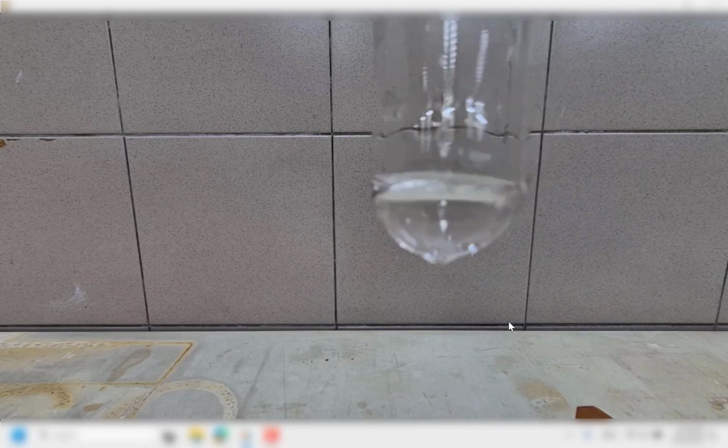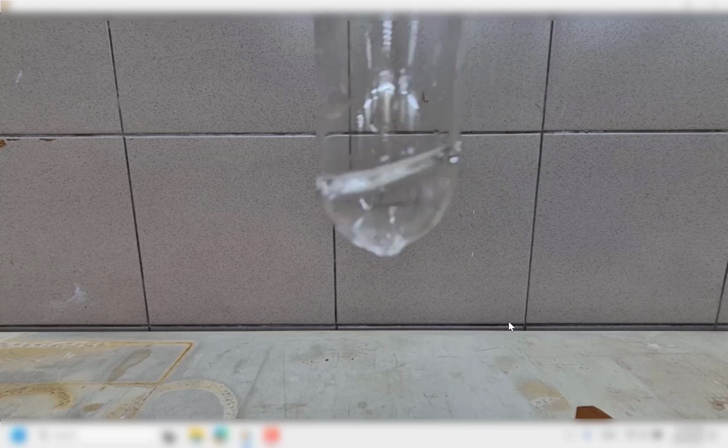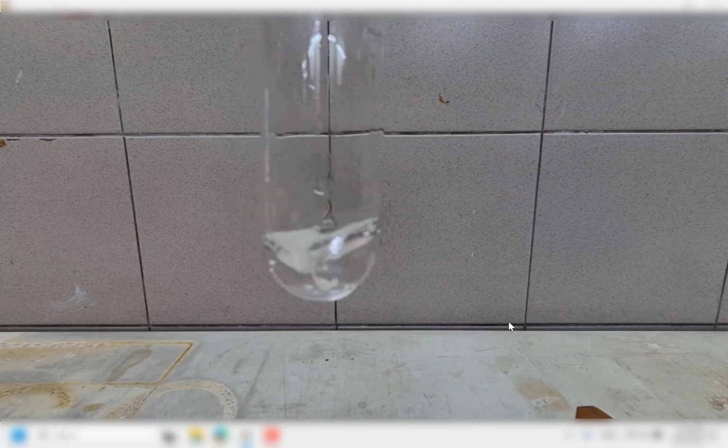Right now, let me play the video. The video has no sound, so I'll be the one voicing over. This is a washed boiling tube. You have FA1 here, and you notice that FA1 is colorless. You're supposed to add in 1 cm depth of FA1. You don't need to measure using a ruler, just roughly add in about 1 cm.